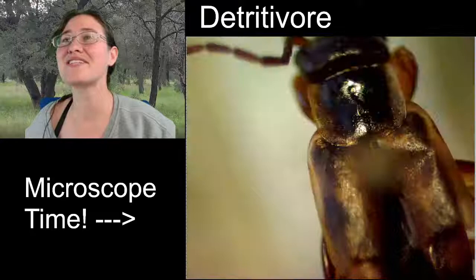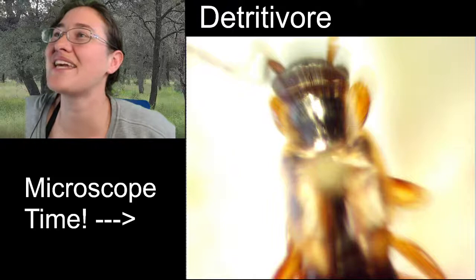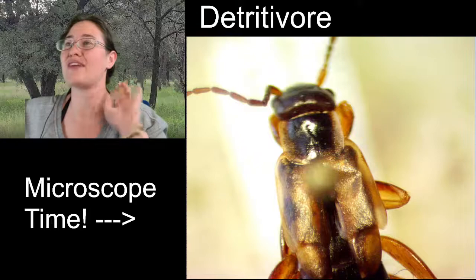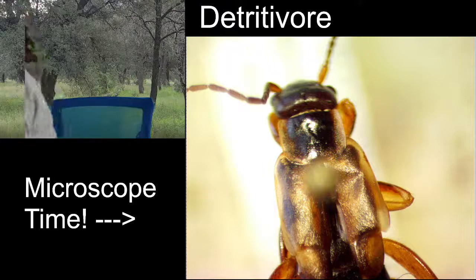They were safe until the end. You always like a nice flange on the edge of the pronotum. That's also a cool statement right there. It's nice and kind of expanded over the center line. So there's an area where it's nice and light, and I was wondering if that was a flange. Yeah, it is. Look at that. Cool.